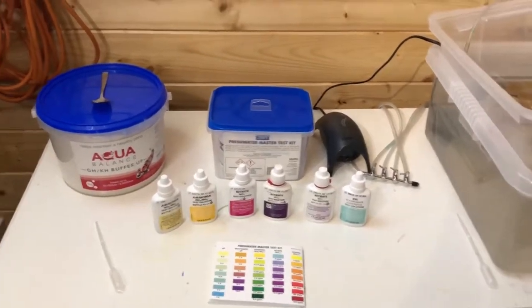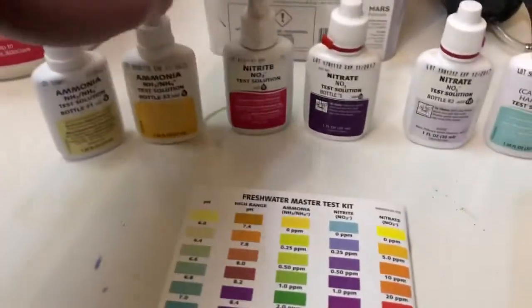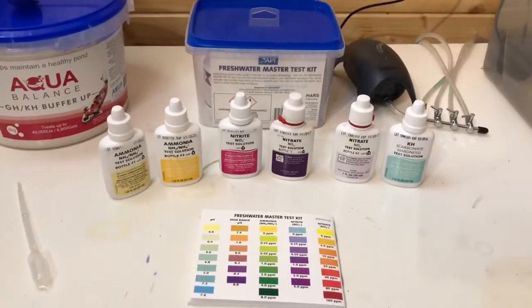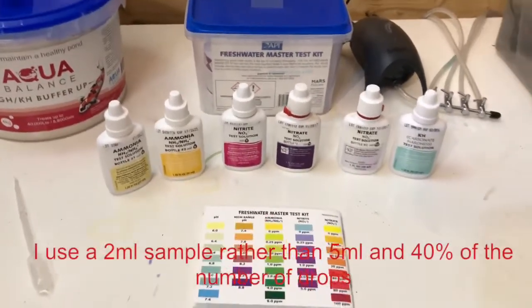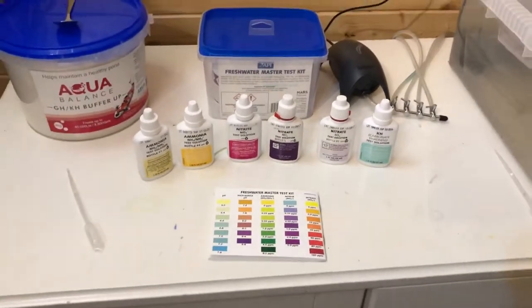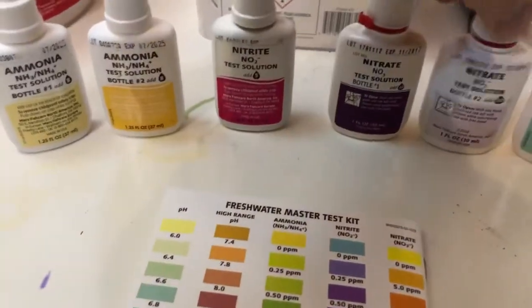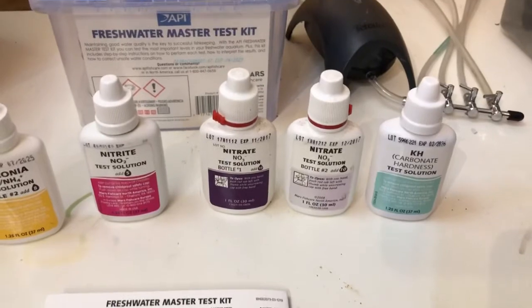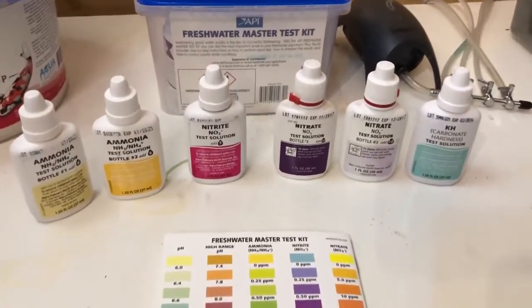experiment. Now, the test kits, I'm going to check my ammonia to check that's all been used up, and nitrite with these API kits. These are really good because you get plenty of tests within the kit, and I also use a smaller amount, so I only use fewer drops, and it still gives me a good test, but it means that the bottles go further. I'm also going to do this nitrate test. Now, my experience of those is that they involve a bit more effort because you have to shake it for a certain length of time after you've put in both of the reagents.